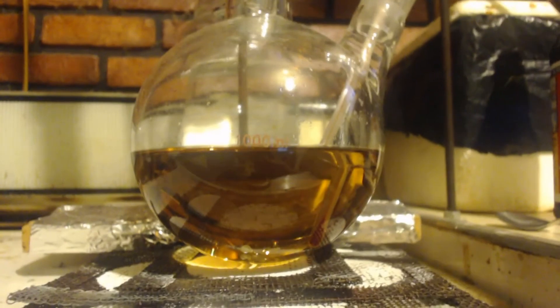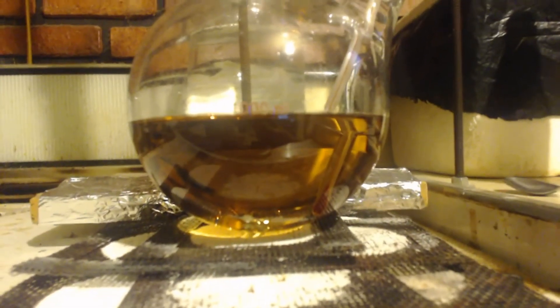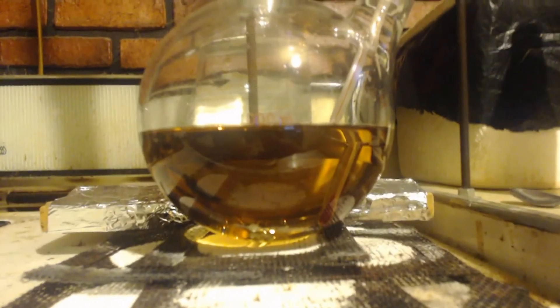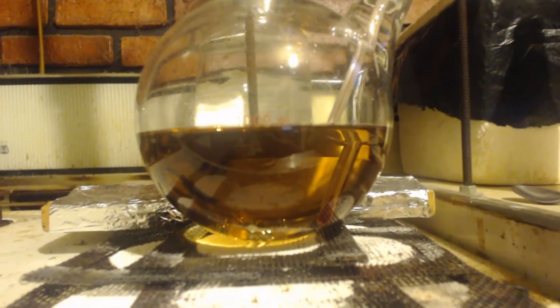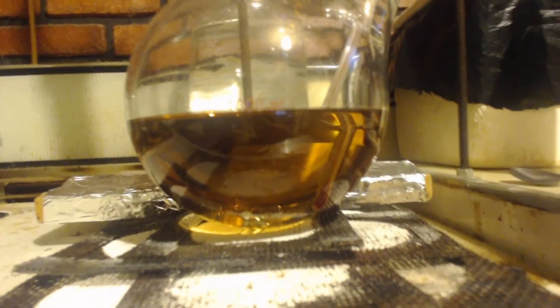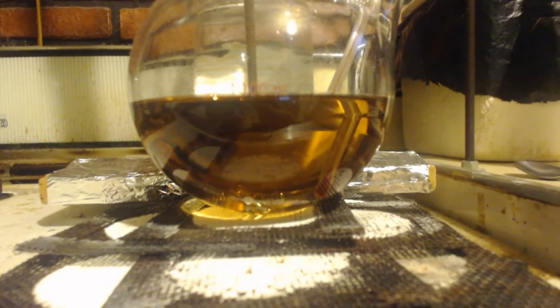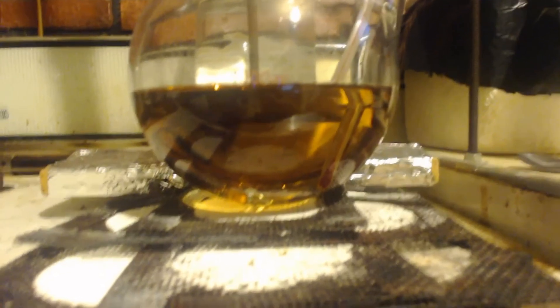So here's our ethyl bisulfate. And it, during the refluxing, it turned from clear to yellow, kind of like urine, to this orange color, this orange-brown color. And now we need to make it into sodium ethyl sulfate.